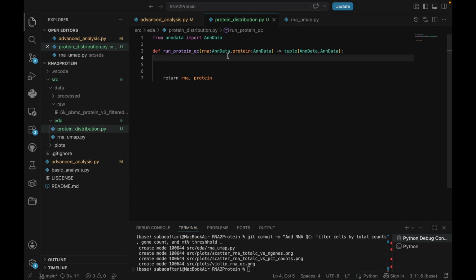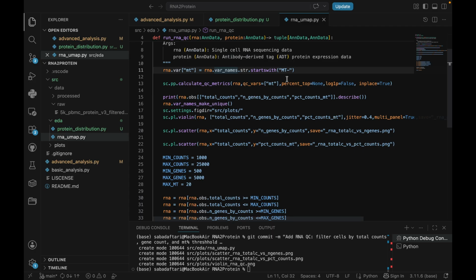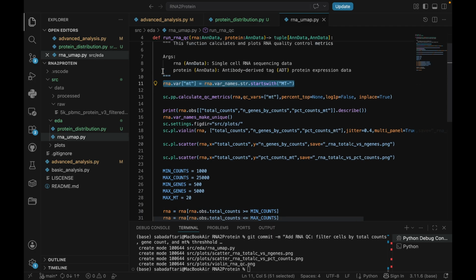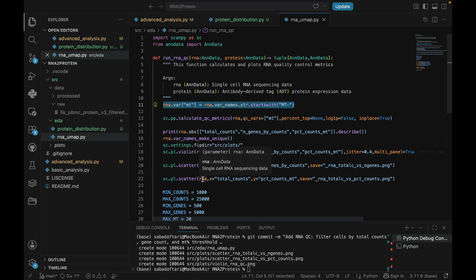Production-ready code: ideally, you want every kind of action you make to be put in a separate function, and then you call functions within each other. Yeah, so I might end up doing that all, but for now let's focus on the.